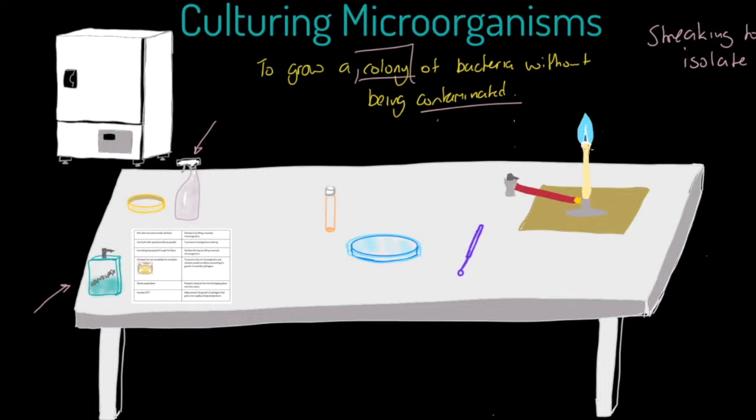We've also got our Bunsen burner in the working area. We'll probably start on the yellow flame but will switch to the blue flame, and that is potentially going to kill off some airborne bacteria in the immediate environment.